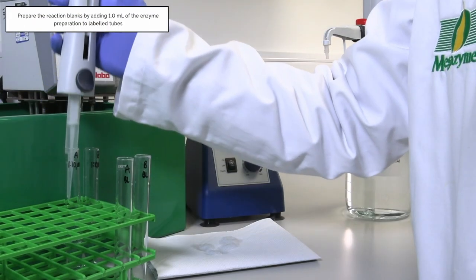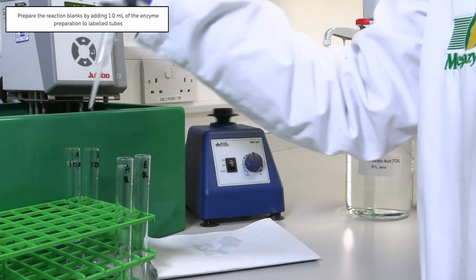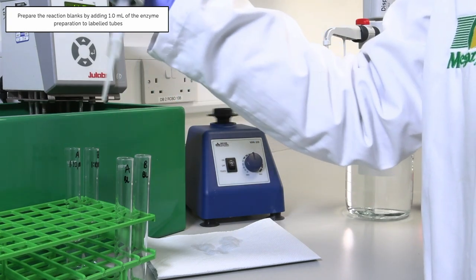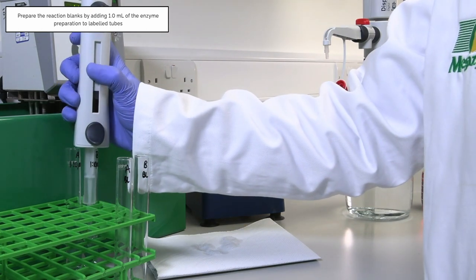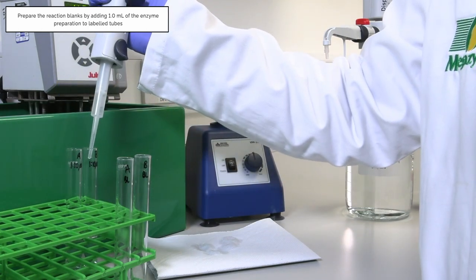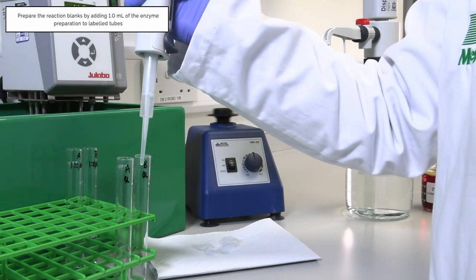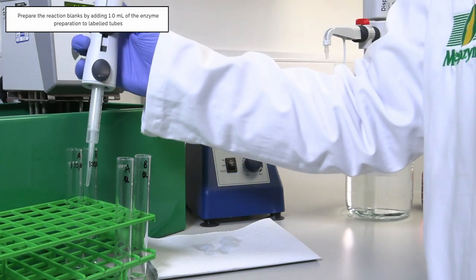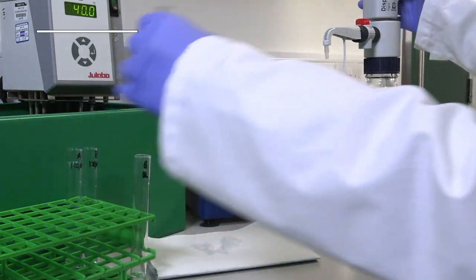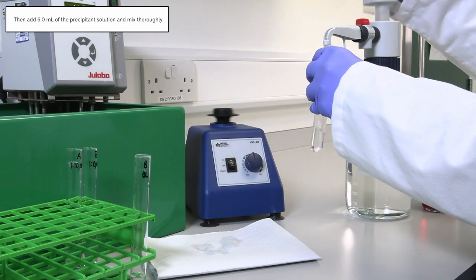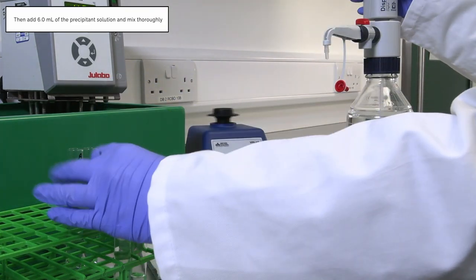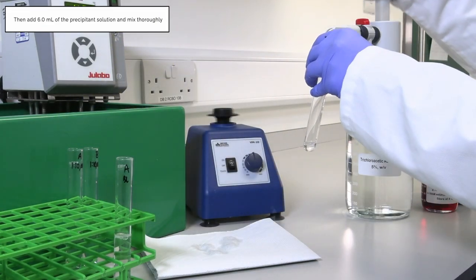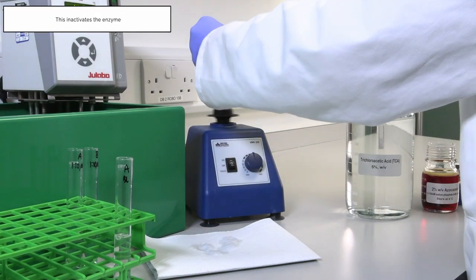Prepare the reaction blanks by adding 1 ml of the enzyme preparation to labeled tubes. Then add 6 ml of the precipitant solution and mix thoroughly. This inactivates the enzyme.